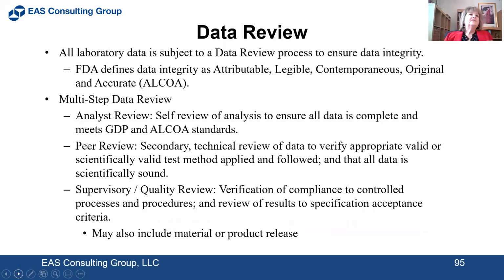Then you're going to review the data. All laboratory data is subject to a data review process to ensure data integrity. The FDA defines data integrity as attributable, legible, contemporaneous, original, and accurate. You should go through a multi-step data review. The analysts will review their own work first, a self-review of analysis to ensure that all data is complete and that it meets good documentation practices and your ALCOA standards.